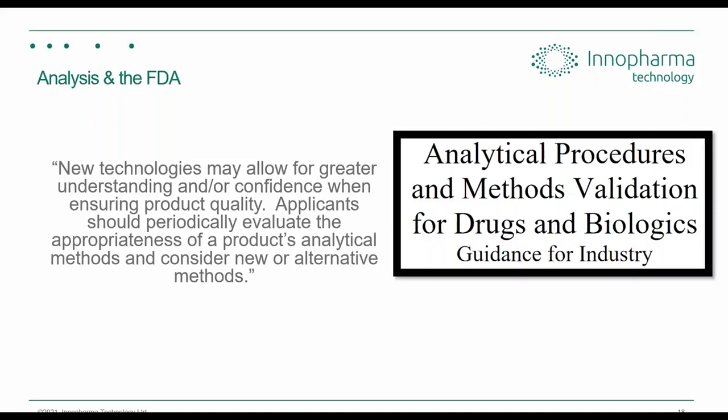So you can bring more technology to the forefront. And also, there's a lot of companies out there who are integrating newer technologies to stay more competitive. They want to leverage these new studies to stay on top of their game. So they might be finding out things like how they can improve yield or how they can reduce batch time, etc., from measuring in real time.